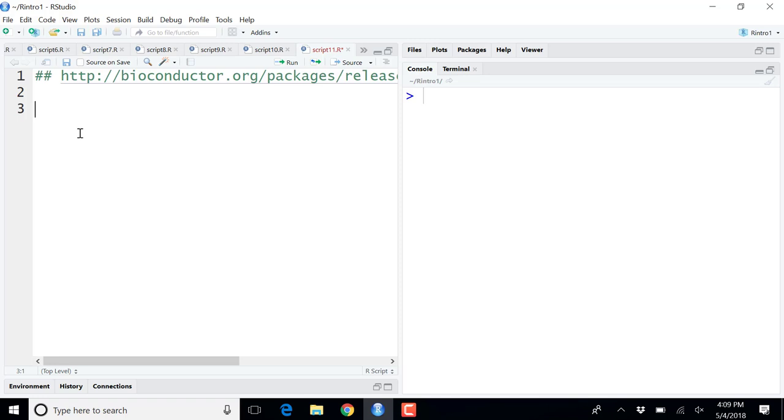Yes. Well, actually, afterwards I'll add another link where I describe a little bit how to get started. So one way would be if you find a paper of interest and they mention the package or an analysis they have done, and they mention a package, that is maybe one good way to go and find exactly the package that you're interested in. Going through the BioC views, these tags are useful.